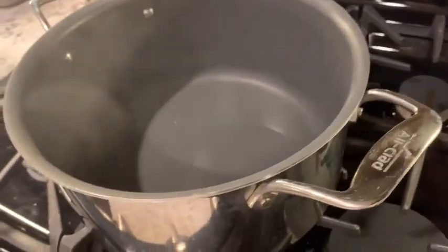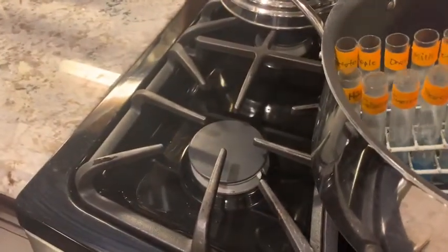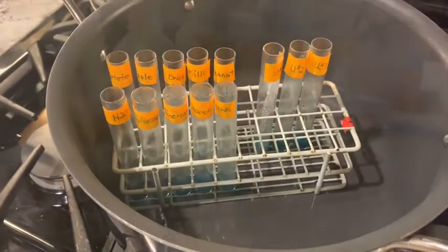Let's now take them and put them into the pot. I've got a pot of hot water right here — it was just boiling — and I'm going to set this inside, trying not to burn myself. This is going to sit in the hot water for about five minutes.